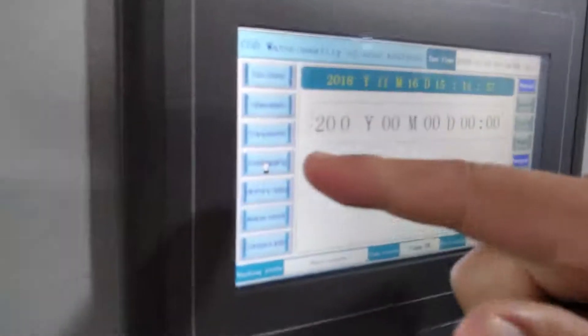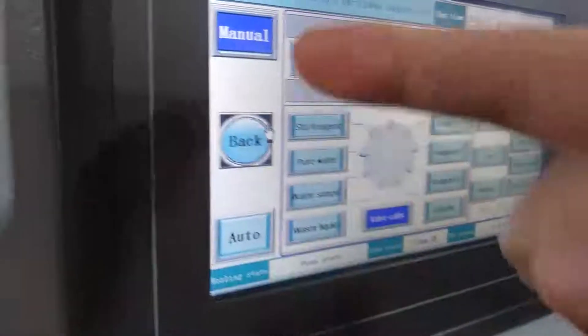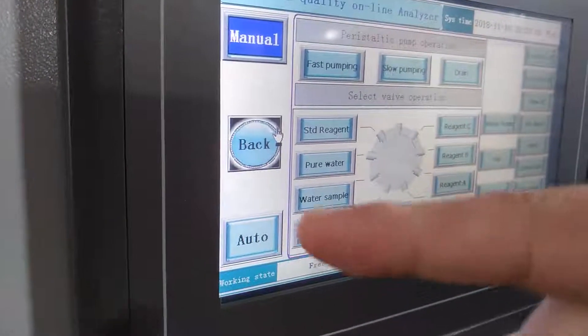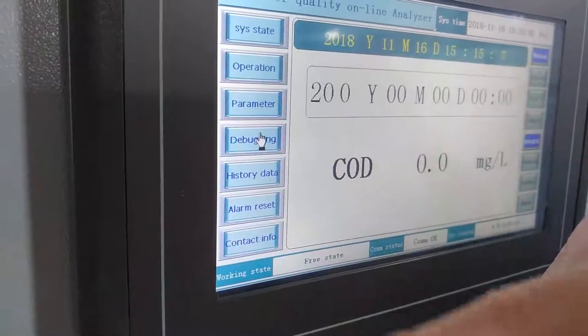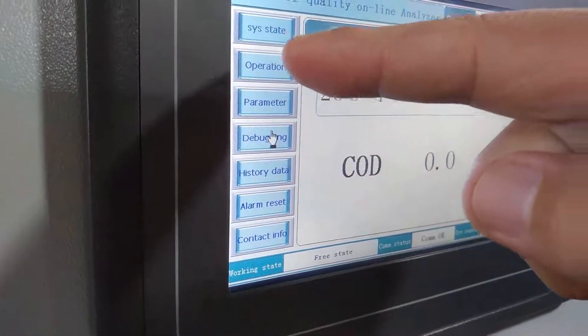Then, the second step: press debug, change it to auto, then press back, then press operation.